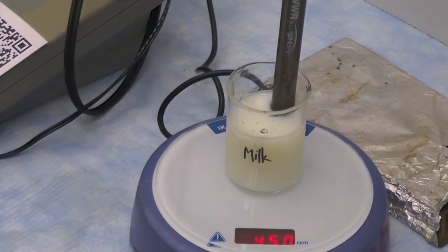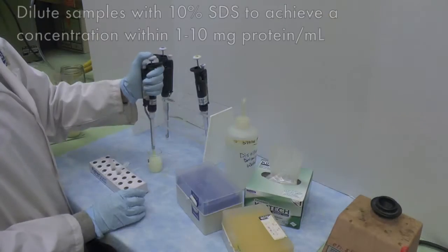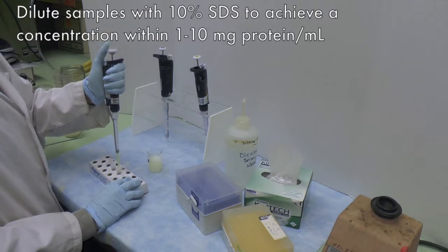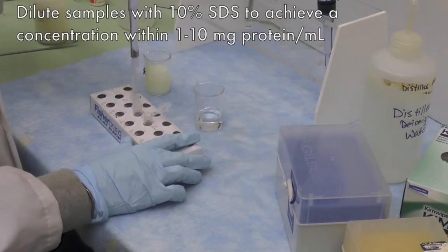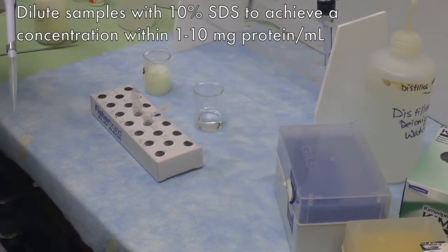First, measure the pH of the milk samples. Dilute the milk samples with 10% SDS in a microfuge tube to a range within 1 to 10 mg protein per milliliter.